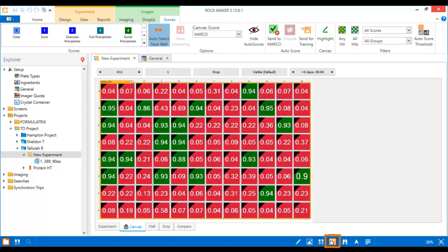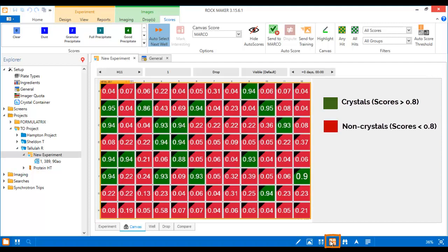For simplicity and ease of use, images are sorted into just two categories: crystal, marked in green, or non-crystal, marked in red. Any score above 0.8 is marked as a crystal, while images with scores less than 0.8 are marked as non-crystals.